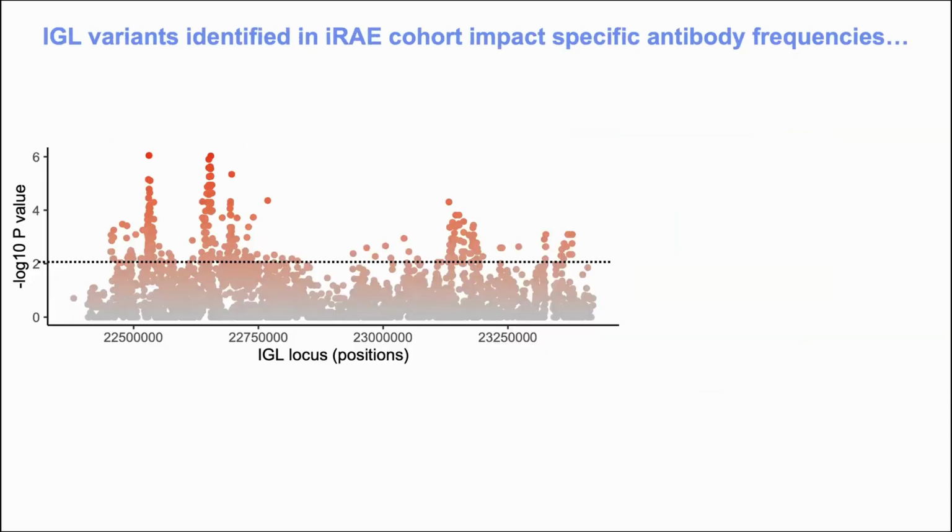So this was the box or the stack on the Manhattan plot that had the most variants above significance. We're going to spread this out across the loci and try to understand whether these variants have any type of functional association. In particular, we're going to zoom in on this variant, a highly significant association with the presence of immune-related adverse events. We also saw that it was enriched in our cohort compared to the control samples that we had, the immunotherapy-treated but no adverse events cohort.